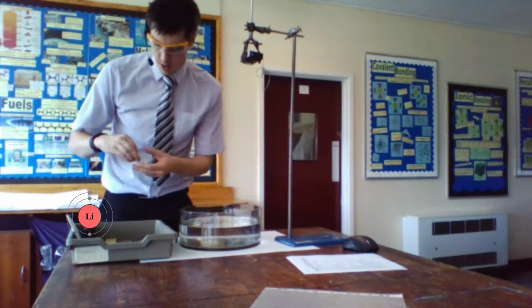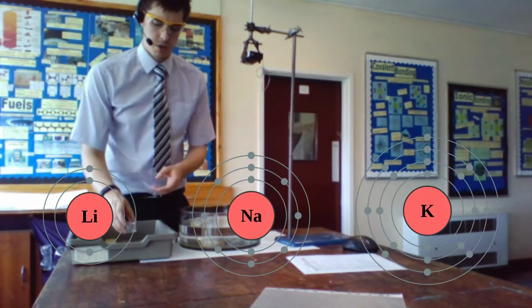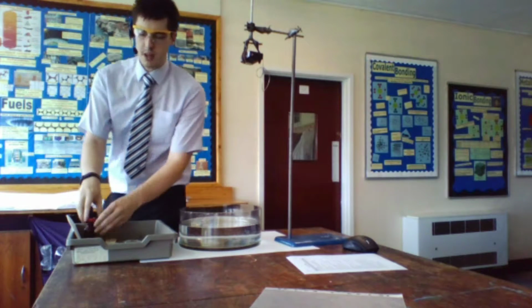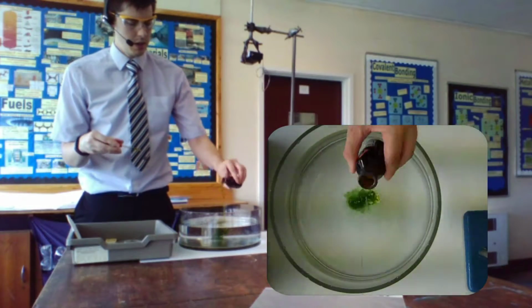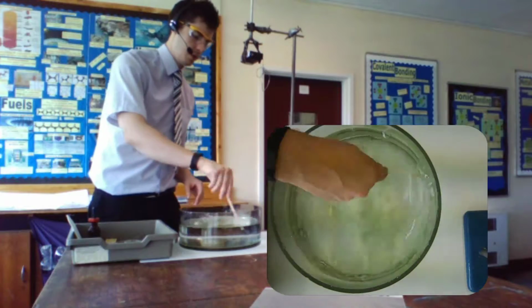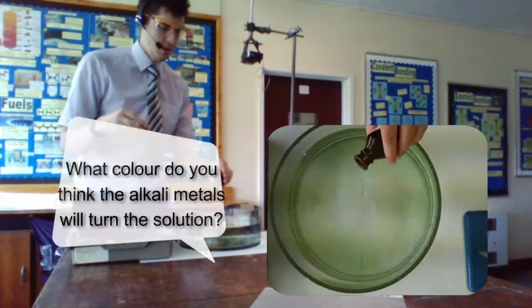Now the ones I'm allowed to show you, we have lithium, we have sodium and we have potassium, which you'll notice if you look at the periodic table, that's the order they go down. So the first thing I'm going to do is I'm going to put some universal indicator liquid solution in. This will show you the pH is fairly neutral. So it's that green colour.